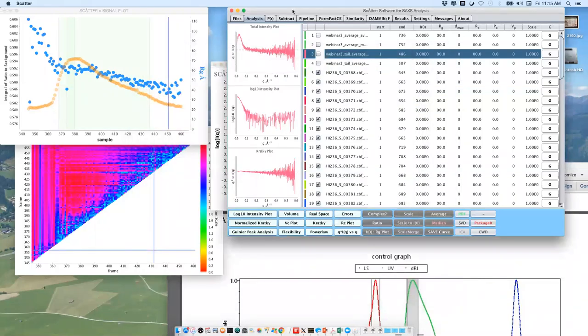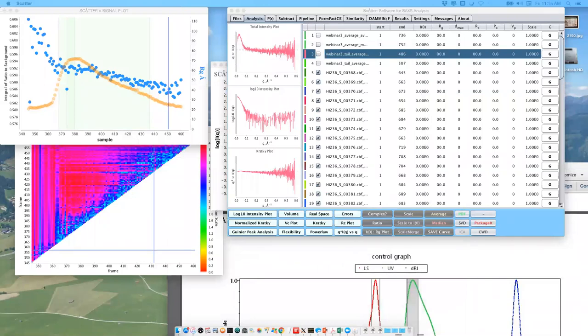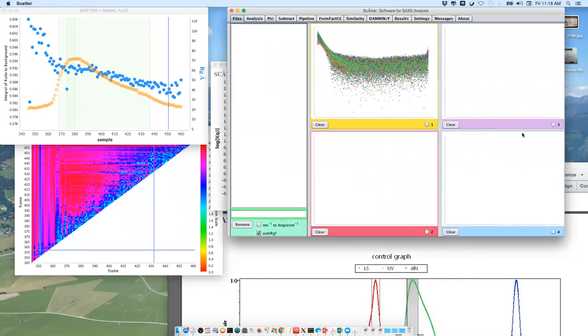Well, you now want to plot it in ATSAS, and that's exactly a trick that I want to show you, because when you try to take the saved component files straight from RAW and put them in ATSAS, those two programs don't talk to each other, and the format of the data files is a little bit different as usual. You will not be able to do it. I'll just give you a heads up. You just go here and try to put it there. Nothing happened.